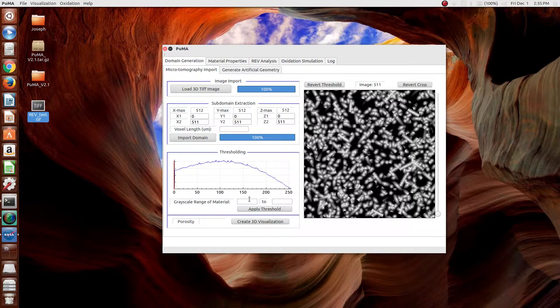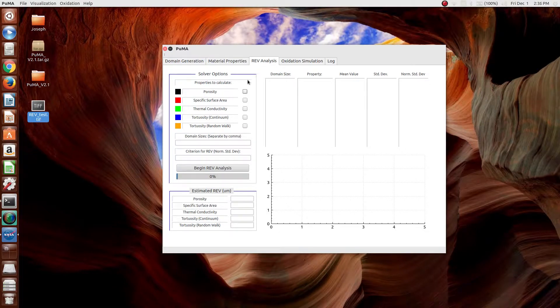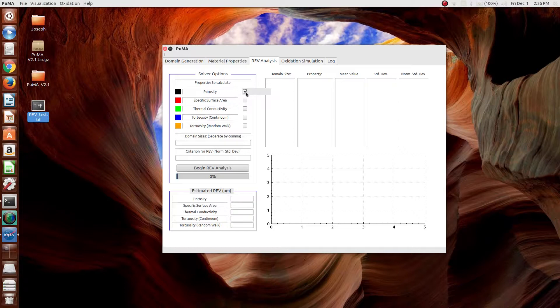In order to compute the representative elementary volume analysis, go to the representative elementary volume REV analysis tab, and select the properties that you want to compute the representative elementary volume on. So, in this case, we'll choose porosity, specific surface area, and thermal conductivity.